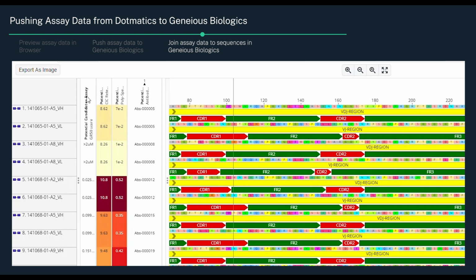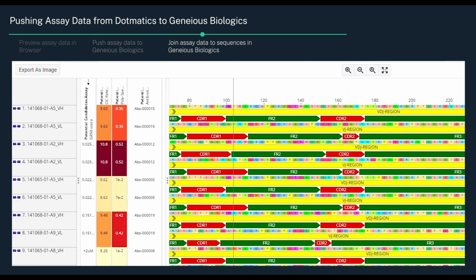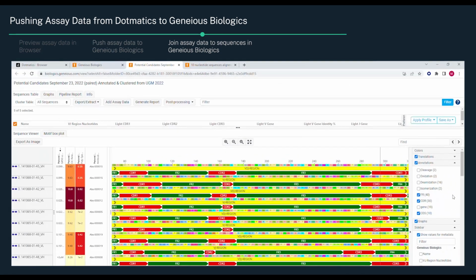By clicking the top of the metadata columns, you can sort on the score. One of the nice things about this feature is you can sort according to ascending or descending order to quickly get a sense for your data.